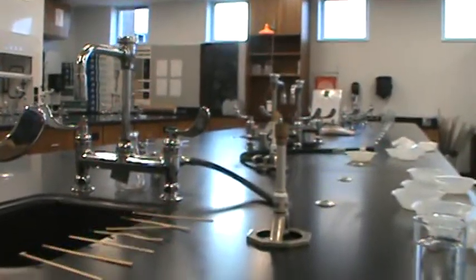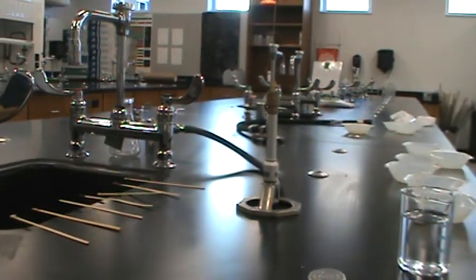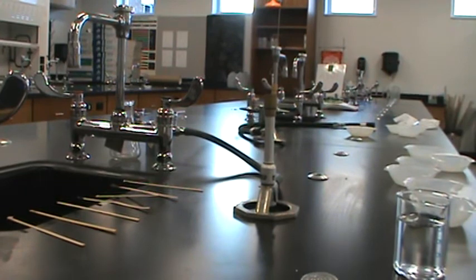So let me get things set up. I'm going to need to get some things out of the way.